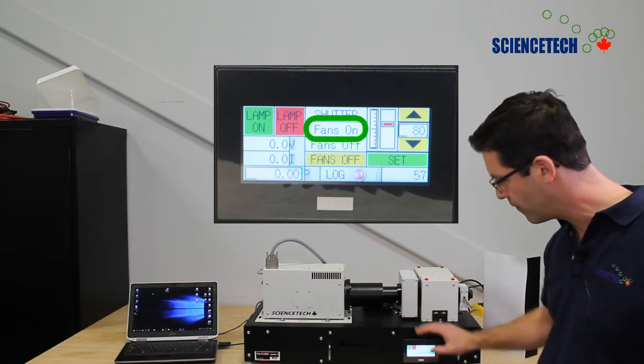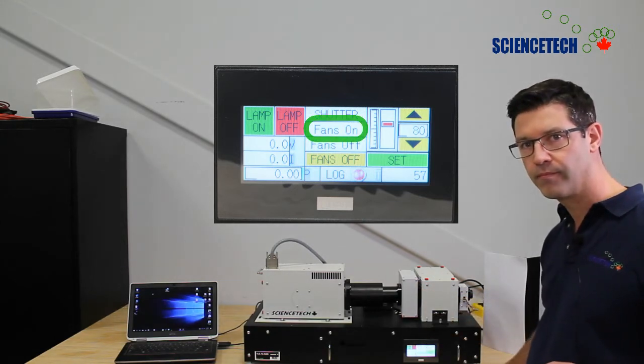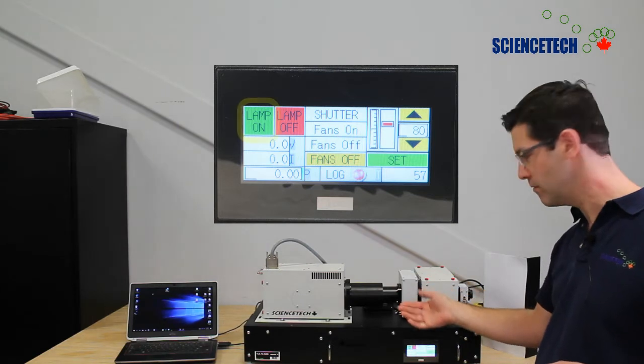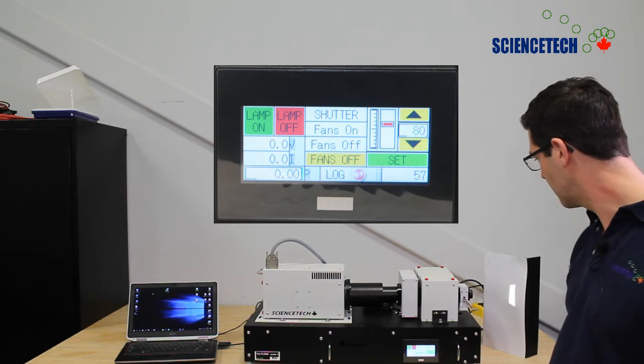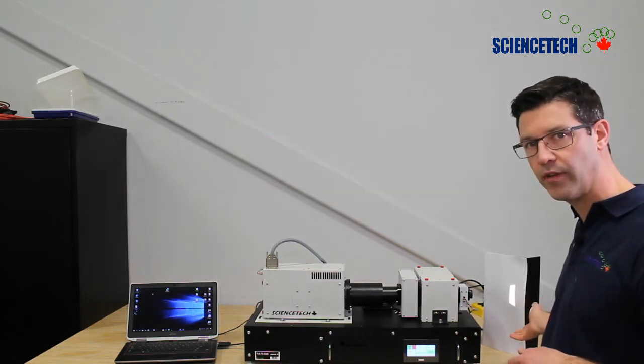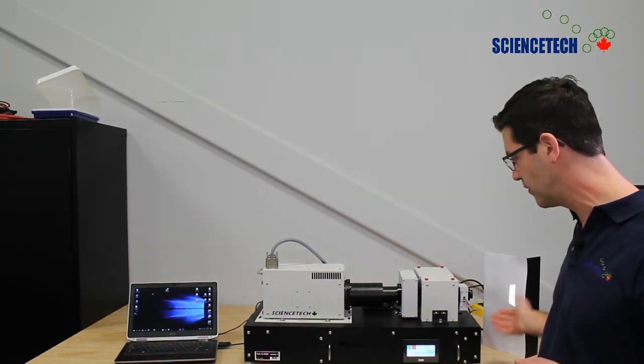Then I'm going to turn on the cooling fans. You can hear them kick in now, and now I'm going to turn on the lamp. Here we go, on the output of the system we have light immediately, just like that.